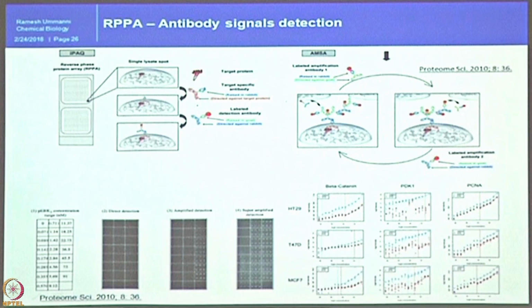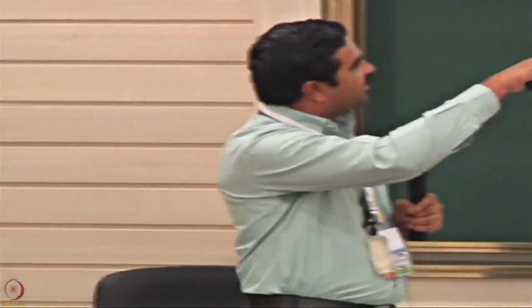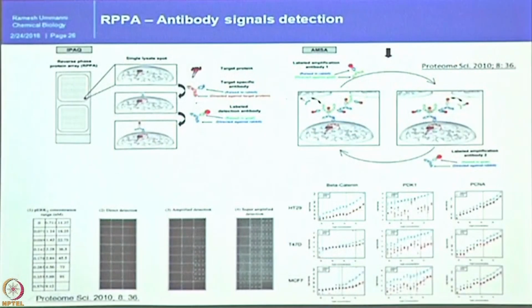One molecule of infrared fluor attached with one round of secondary-to-secondary antibody will give two fluorophores. Then if you repeat this for 3 or 4, or 5 antibodies, one protein target is attached to 5 different signaling molecules, then obviously your signal will be increased by 5 times. So, this reiteration step will increase the signal.